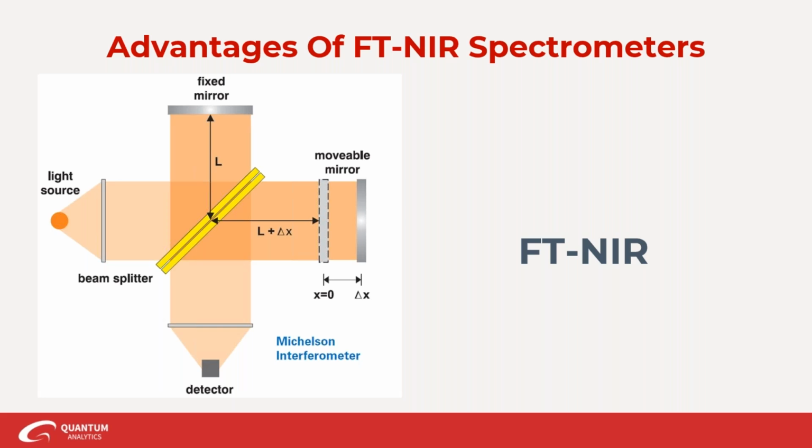It's very fast. It measures all of your wavelengths simultaneously. You get higher resolution, higher signal energy. It uses an internal reference laser to accurately calibrate your wavelengths. You don't get any stray light with this. Stray light can be a real issue with dispersive type instruments.